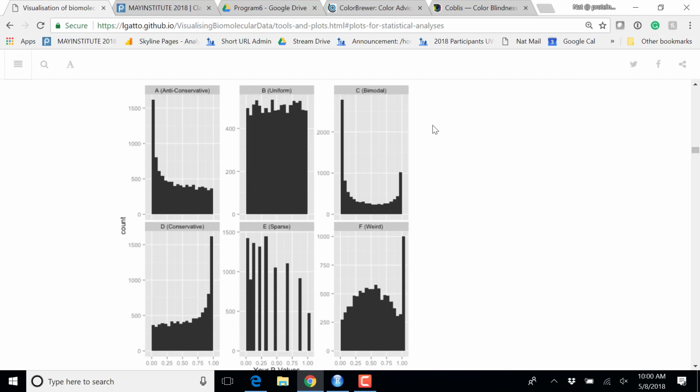And here's a slightly more pathological case. And again, when having something like this, you should definitely stop and try to debug these p-values. But clearly, whatever the distribution is, it's important to look at these. Okay? In these cases, after adjustment, you won't get any significant p-values, so you could argue, oh well, I don't need to look at my p-values if I don't have any significant results. But here, clearly, this will have a negative impact on your adjustment. And so you could lose important genes because of this weird distribution.